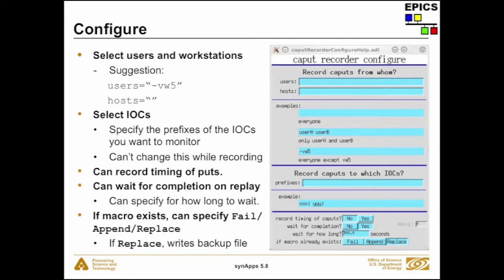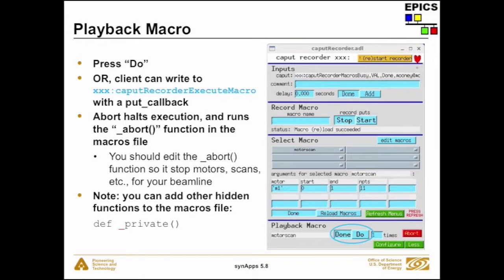Are you saying it's like hits the all stop? Yeah. Okay. Yeah, it's the all stop button and the scan abort button, and you can hit anything you want. Okay.